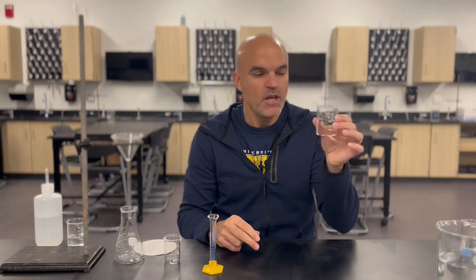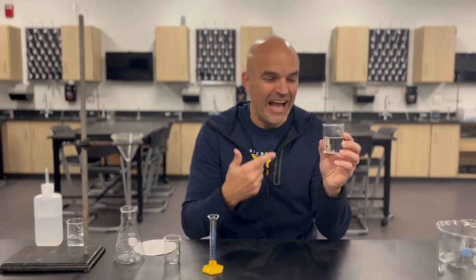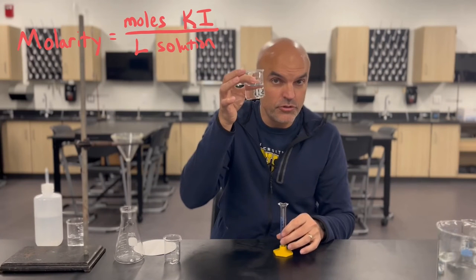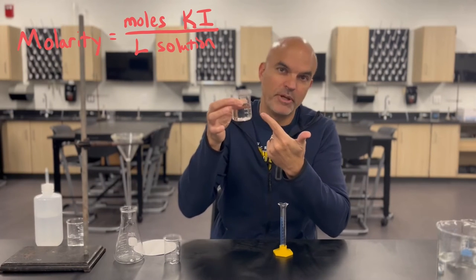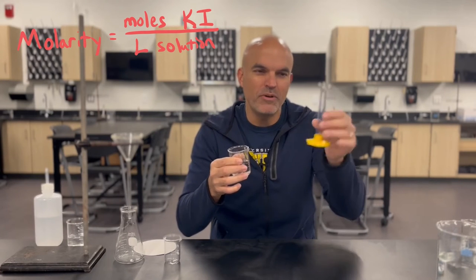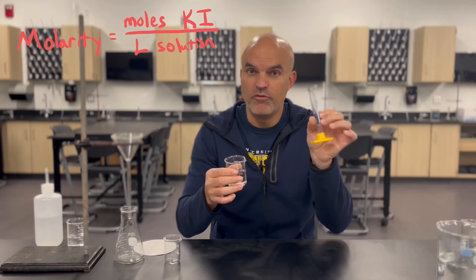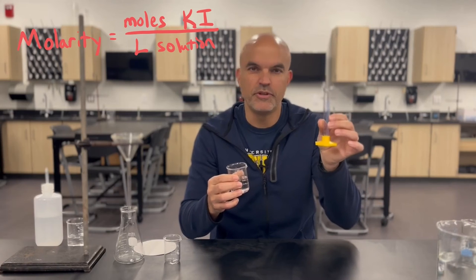Today we're going to determine the concentration of a solution — not salt water, but a solution of potassium iodide dissolved in water. I want to know what the concentration is: how many moles per liter, the molarity of the solution. To do this, I'm going to take just a portion of this solution, because a small amount poured out will have the same concentration. I'm going to take about 9 to 10 milliliters using this small graduated cylinder, which is pretty accurate for volume measurements. Alternatively, you could use a burette for even greater accuracy.